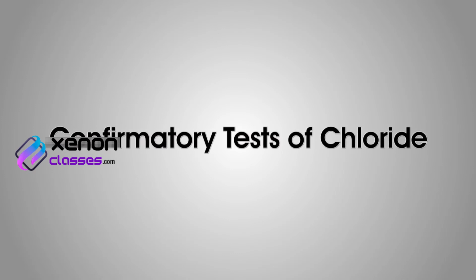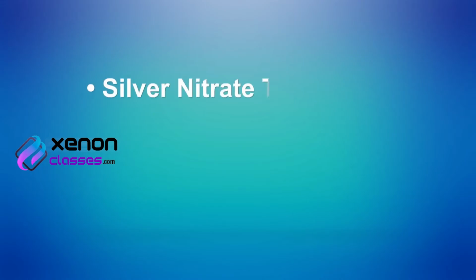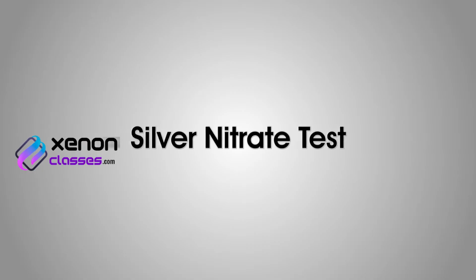Next, we look at the confirmatory tests of chloride. The confirmatory tests are silver nitrate test, manganese dioxide test, and chromyl chloride test. Silver nitrate test.